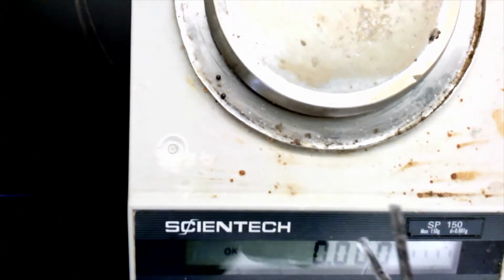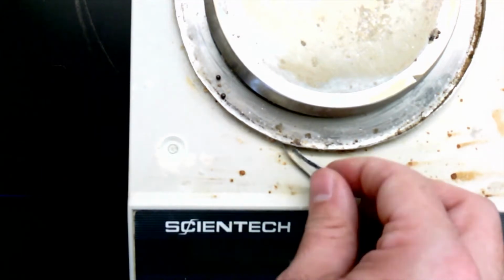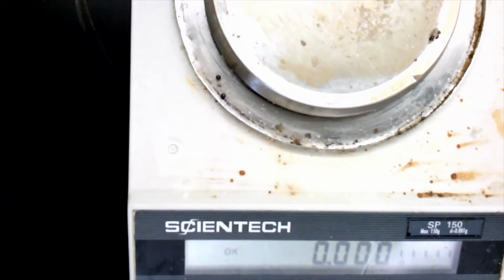Okay, so now, let's see if you guys can see this. You can see I've gotten a lot of this corrosion off. I broke my piece of magnesium in half, but that's not a big deal. I've exposed a lot of this shiny surface. I'm going to go over it one more time just to try to get it all nice and shiny. Okay, now the next thing, it says in our procedure to get a piece of magnesium ribbon and polish it. So we did that.